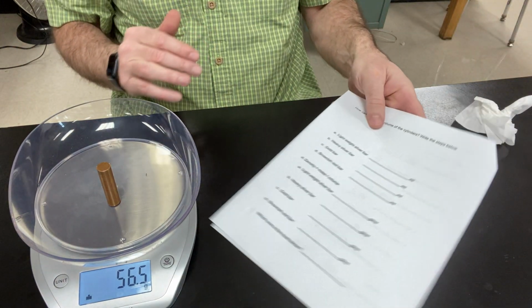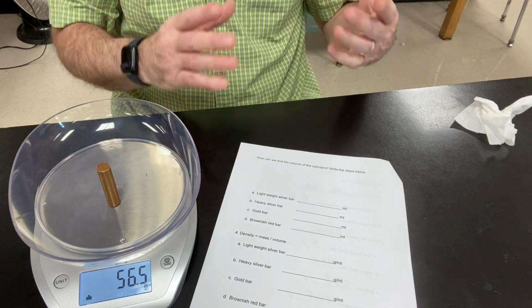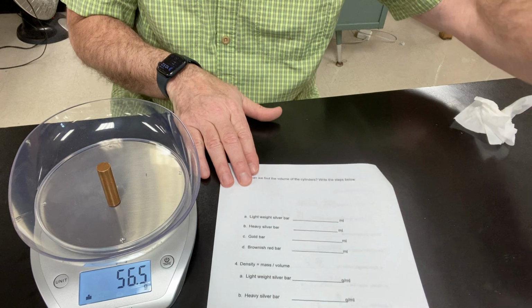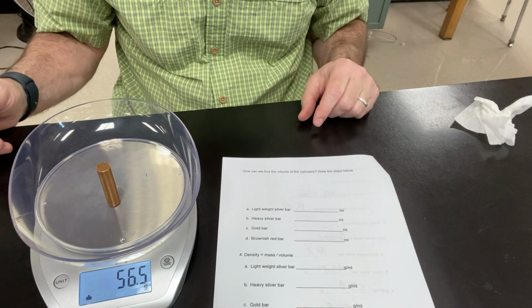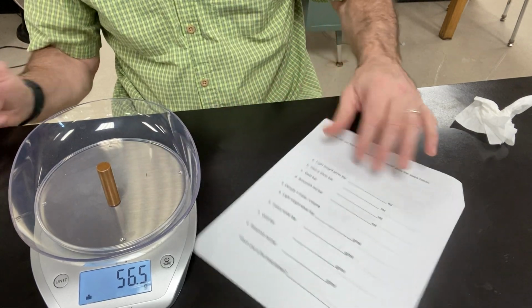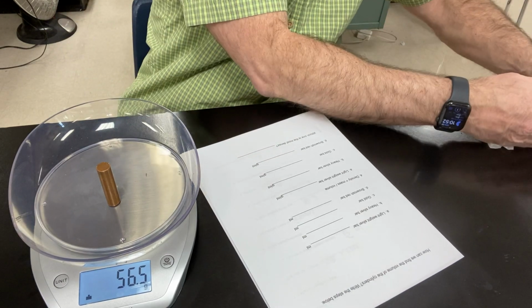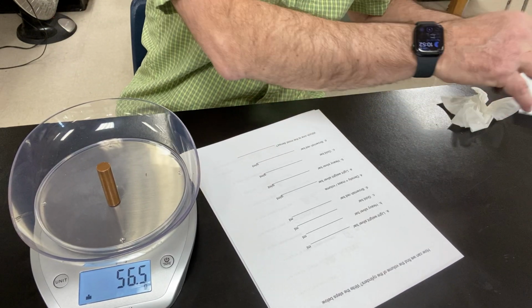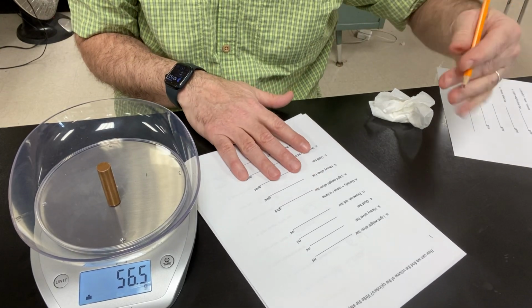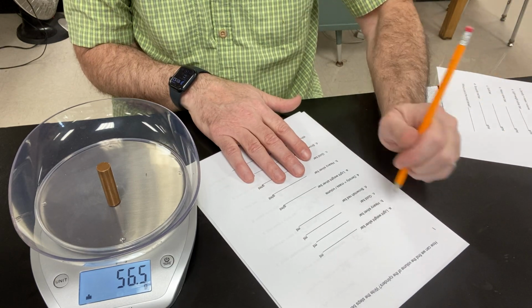Now I have to write instructions. It says, how can we find the volume of the cylinders? Write the steps below. We did this the other day where we used an object that couldn't be measured, and we put it into the cylinder, and we wrote a procedure on that. Okay, so we're going to do that again here, and here's what we're going to write. I don't want to deviate too much from what I wrote before, so I'll open this up, see what I got here. All right, so 1, and steps are when you use numbers or dots or something to let you know that the next step comes up.